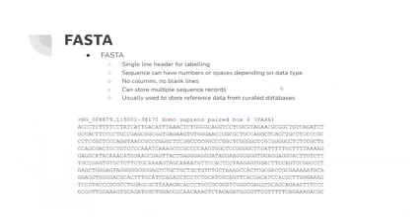All right, so another format is FASTA. It's similar to the Fastq file in that it can also contain multiple sequences, but these are more used for longer sequences that have been reconstructed from your fragments in the Fastq file. These are usually used to store reference data from curated databases.